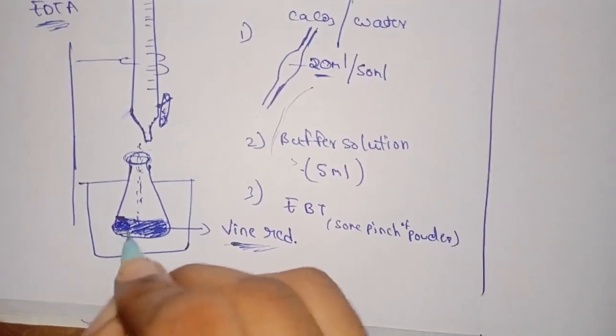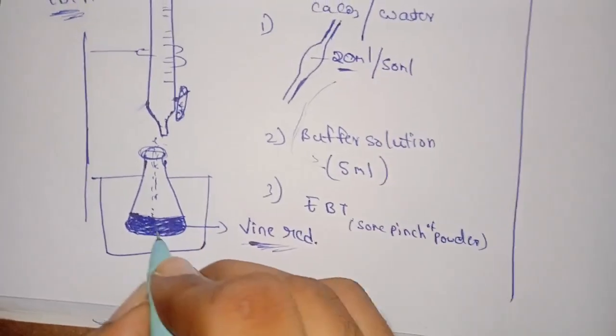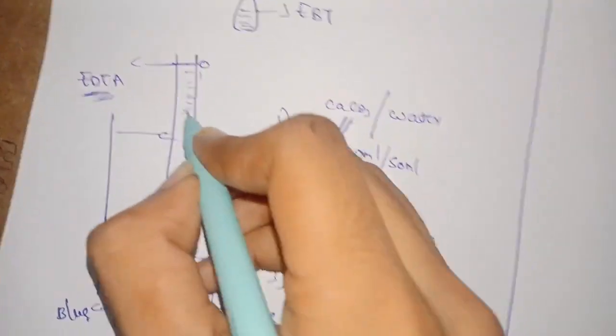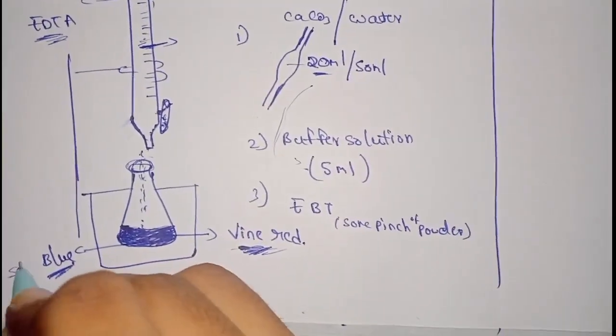When the solution turns blue, that is the end point on the burette.